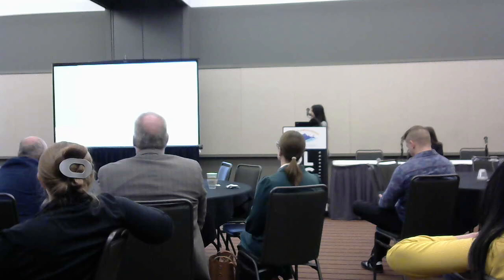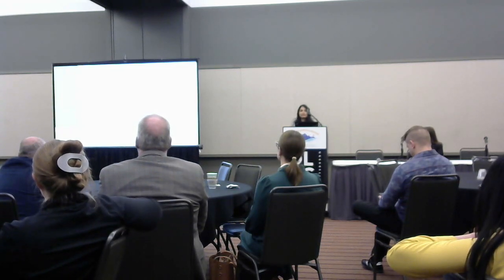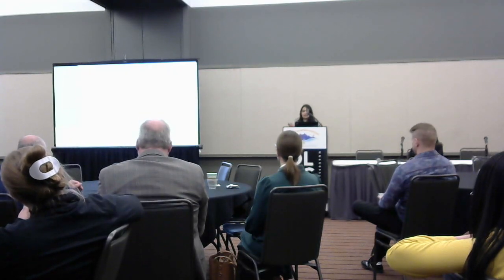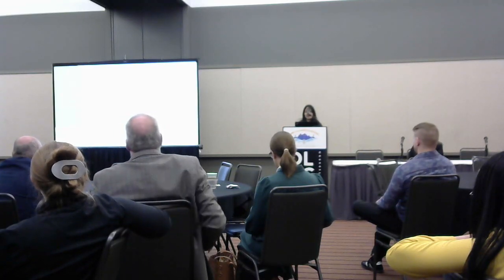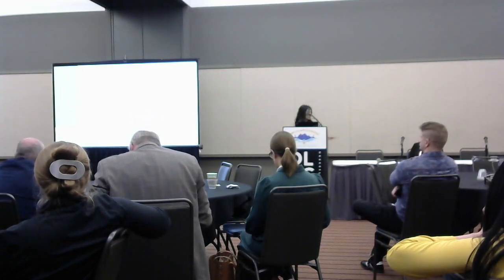But in spite of that, I think we've still made some progress, definitely including a direct processing line, whether with a 10 gig network connection, or the 25 gig for the Lightsheet. That has helped us remove some of the bottleneck. We have also started launching specialized image analysis workshops, similar to what Shannon said.